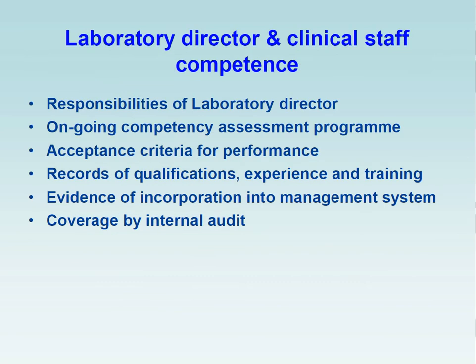The laboratory director and clinical staff competence. So now they have very listed responsibilities and they're going to be held to them. As we've heard in the earlier talks about the professional liability for these people, whereas before they just say, oh, well, the lab manager looks after that side of things. It's now the responsibility of the laboratory director to make sure that these processes are taking place. You need to have ongoing competency assessment for all of those individuals.